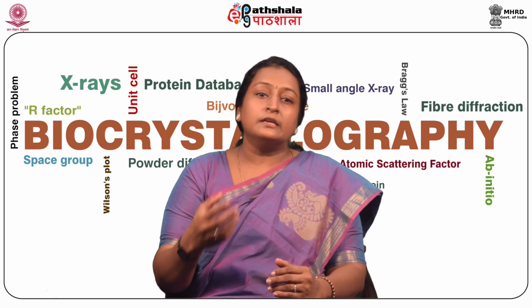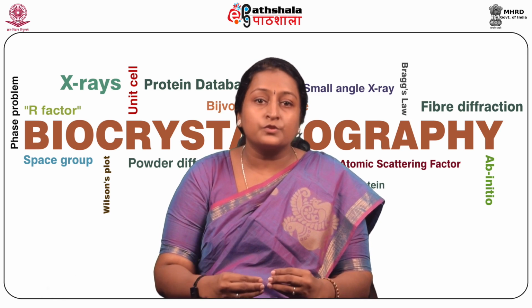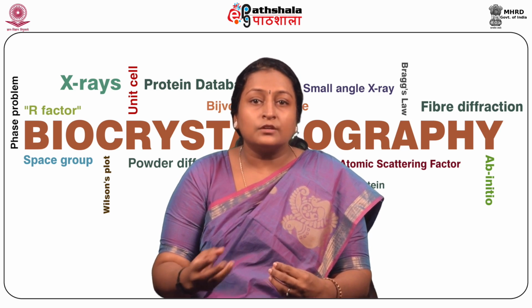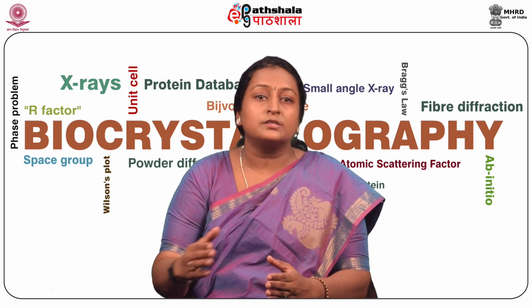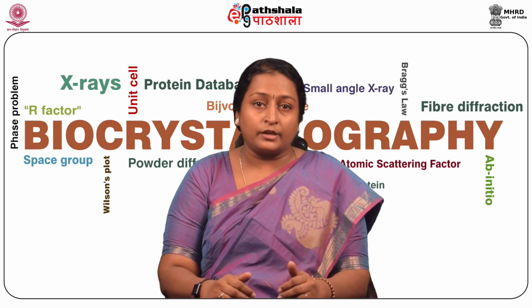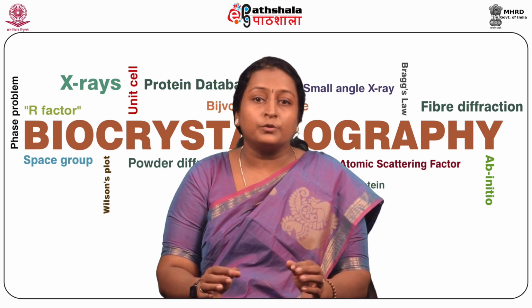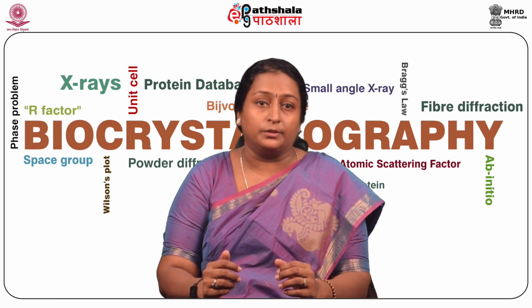Crystallographers generally use the single crystal diffraction method to determine the structure. But if single crystals of appropriate dimension do not grow, then one goes for powder diffraction. For those who do crystal growth research, powder diffraction is a kind of standard technique to index the various planes. For structural studies, single crystal X-ray diffraction was often thought to be synonymous for several decades. Powder diffraction has made important contributions to the understanding of materials, structure and also their behavior.